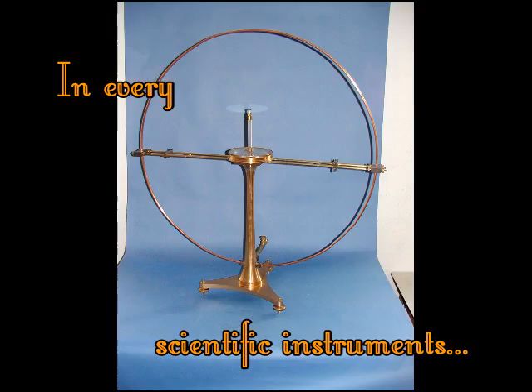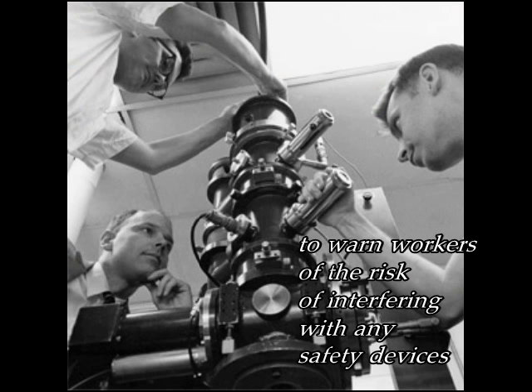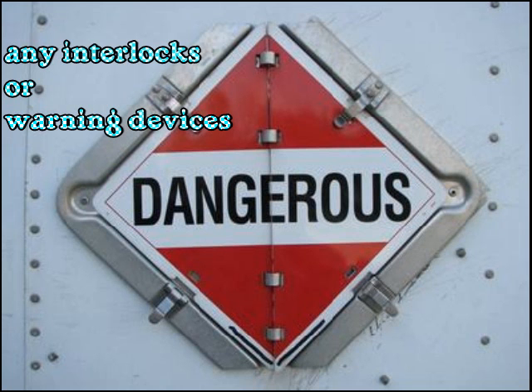In every scientific instrument, there are lots of safety concerns, like to warn workers of the risk of interfering with any safety devices, because an investigator needs to have permission to override any interlocks or warning devices.